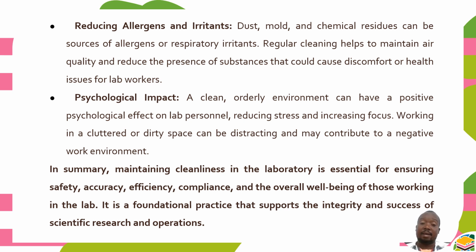So in summary, therefore, maintaining cleanliness in the lab is essential for ensuring safety, accuracy, efficiency, compliance, and the overall well-being of those working in the lab. It is a foundational practice that supports the integrity and success of scientific research and operations. So cleanliness is indeed very, very important.